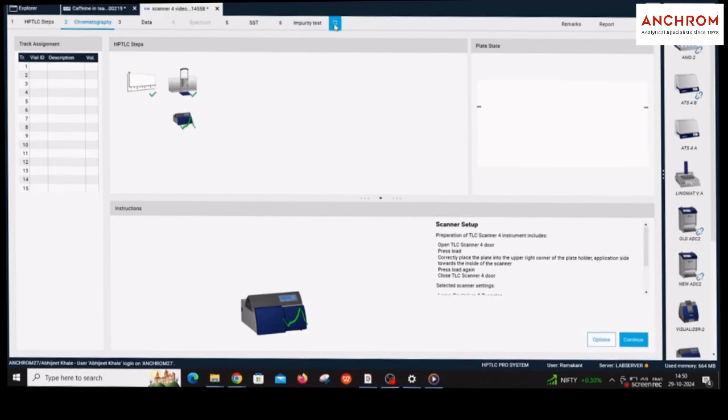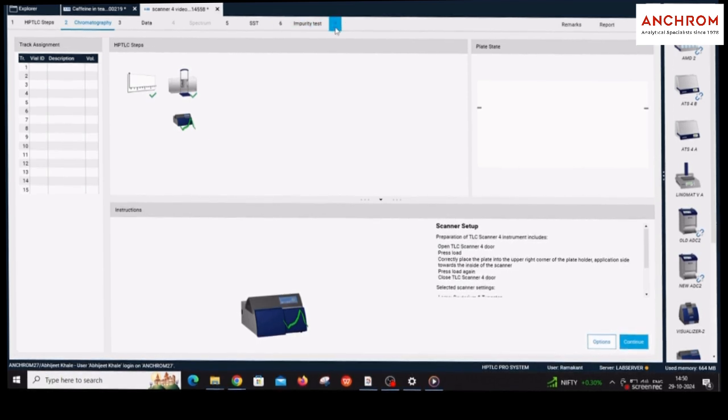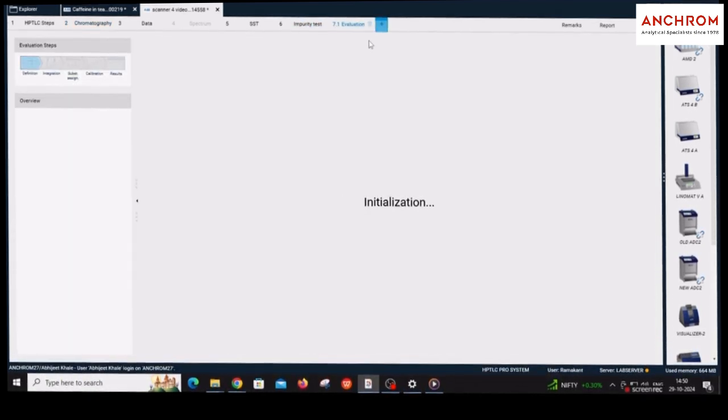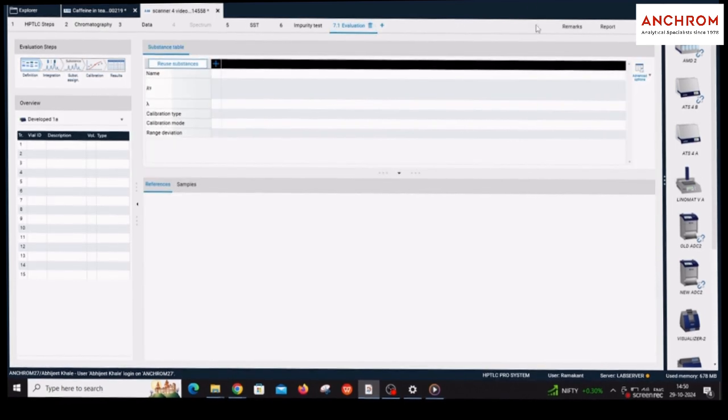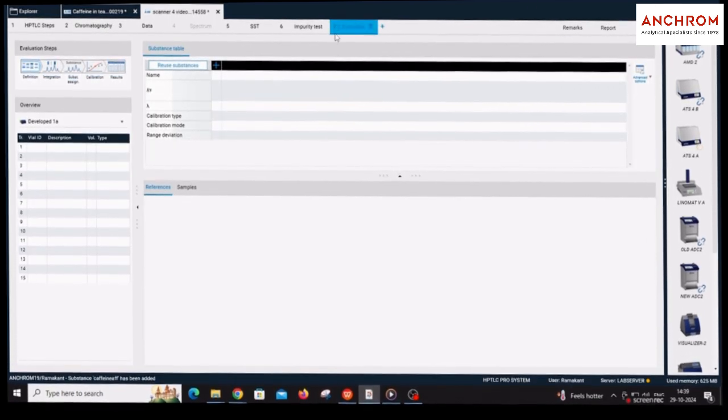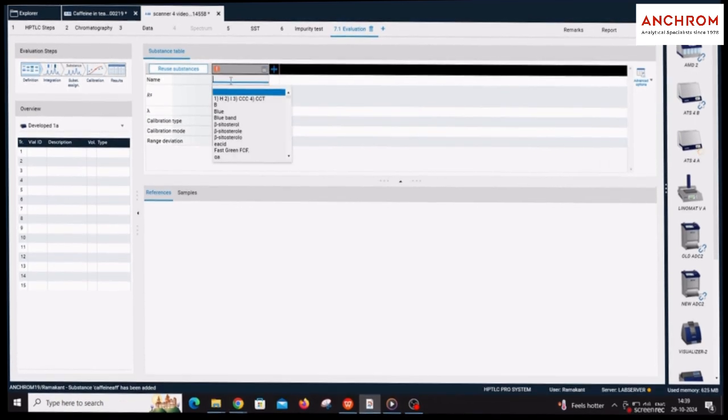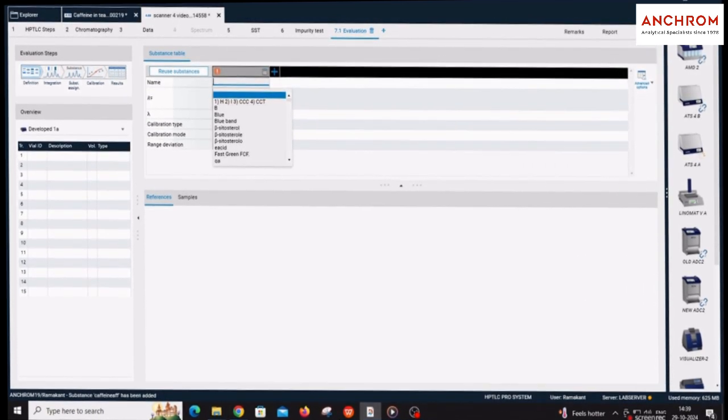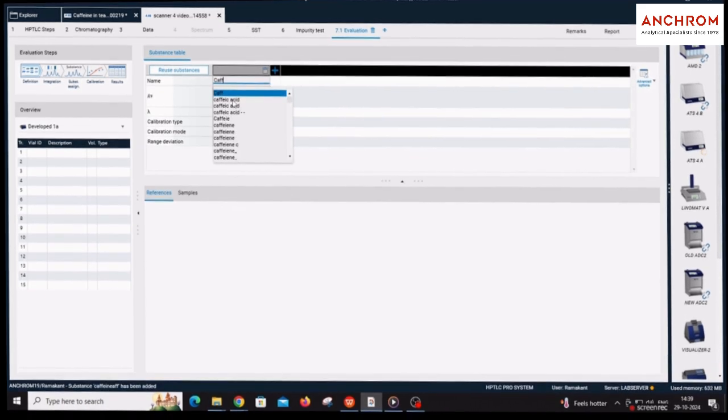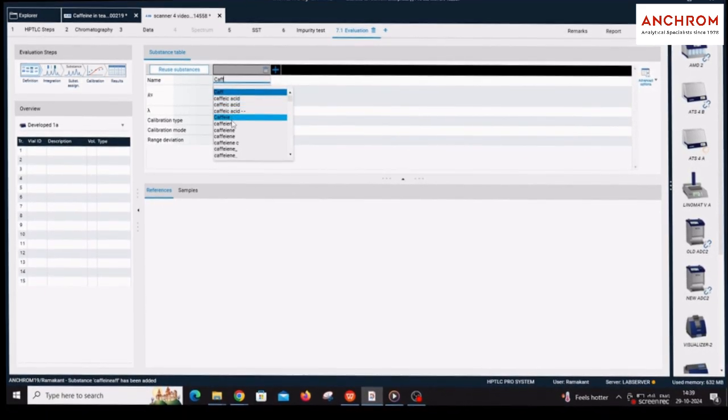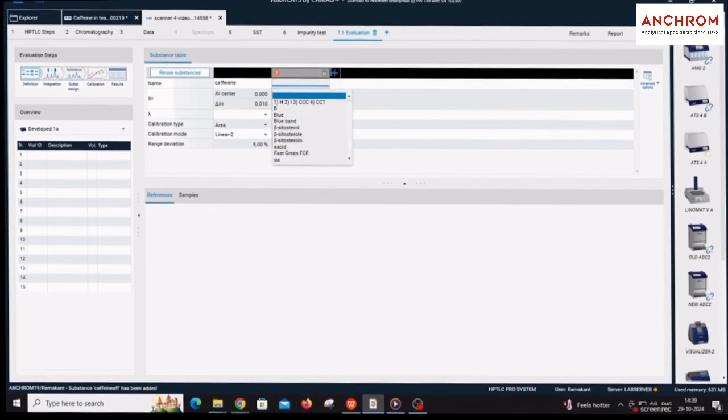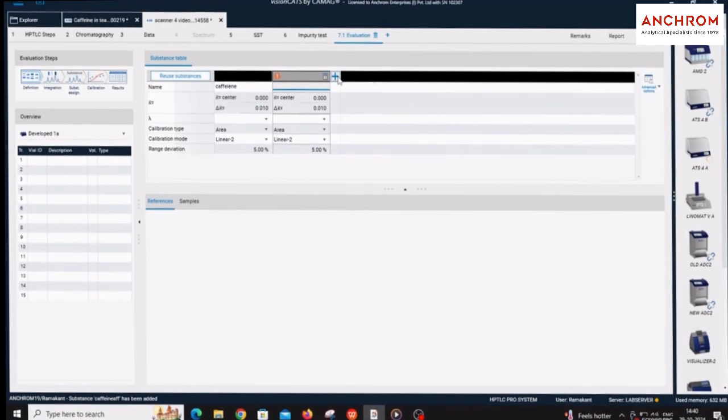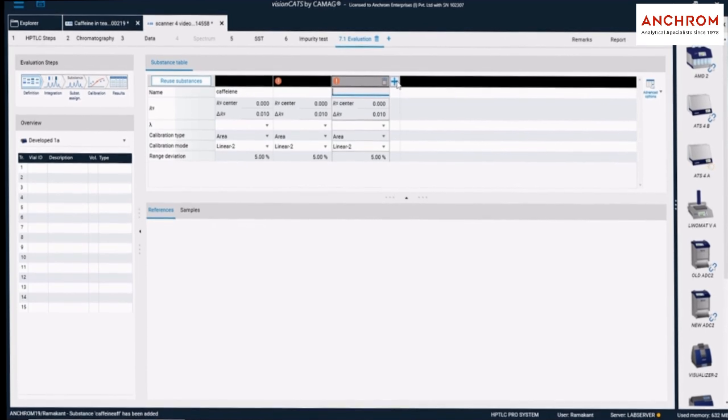Click on the plus sign next to the impurity test option to open an evaluation tab. Under the evaluation tab, click on plus sign and add the name of the substances which you want to identify and quantify. If more than one substance is there, add multiple substance names by clicking on plus sign.